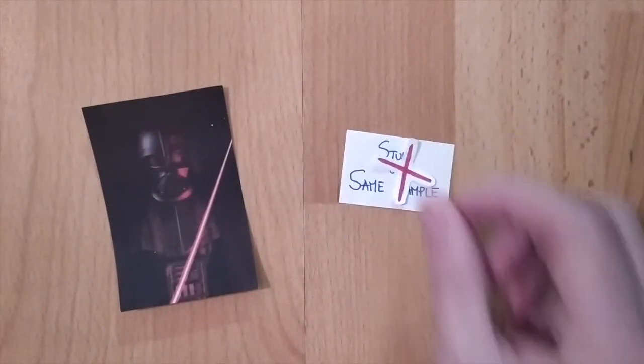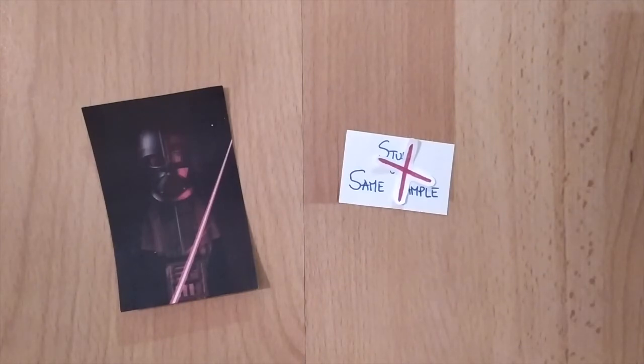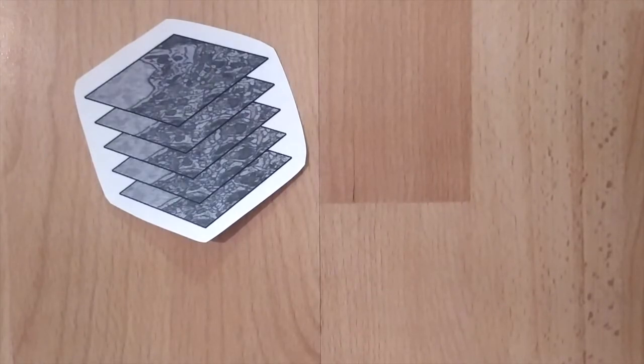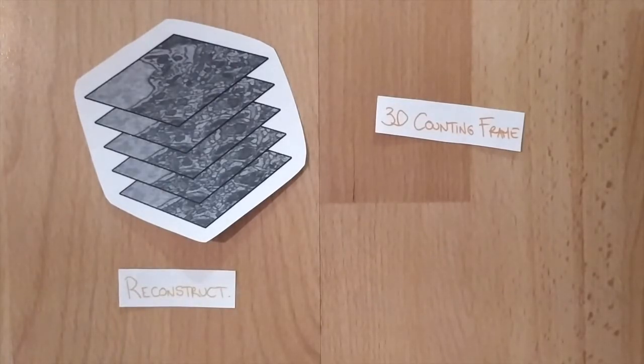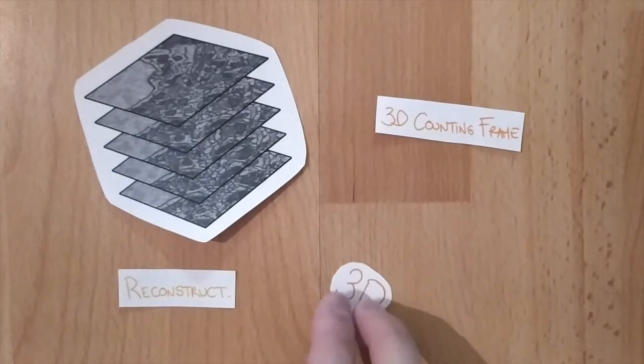However, FIB has a dark side. It destroys the sample already acquired, which makes the study of the same sample impossible. But it's one drawback over many advantages. So, anyway, this is how they obtain their whole stack of images, what we call the 3D counting frame. Nevertheless, those images need to be processed, and to do this, Perez's team used different software. And the most interesting one is Reconstruct, which was useful to represent synapses in 3D.